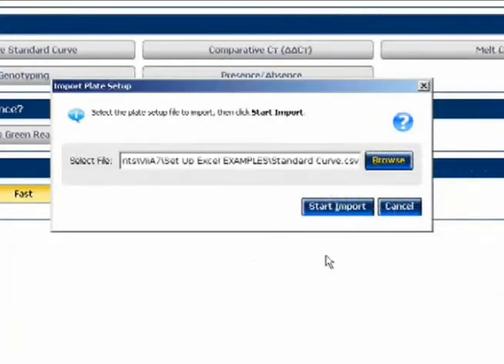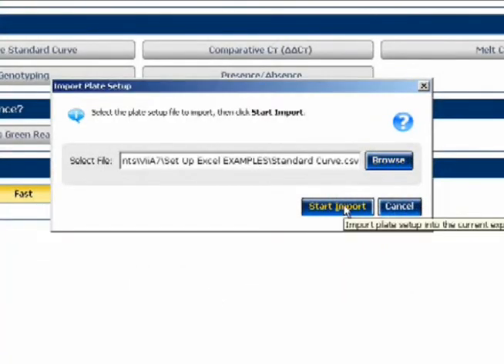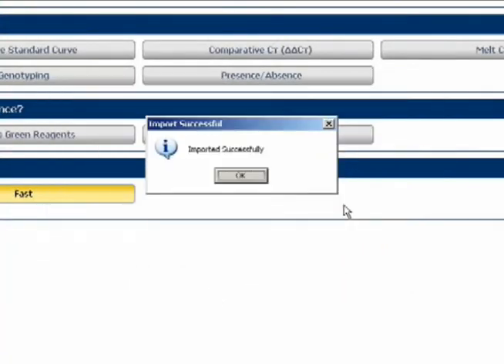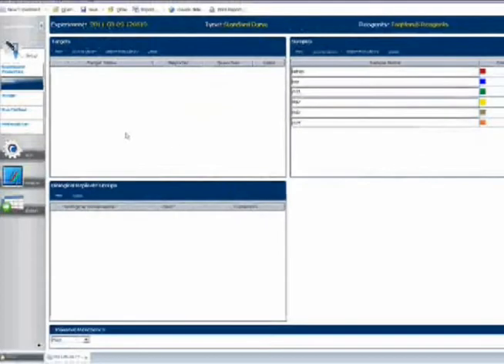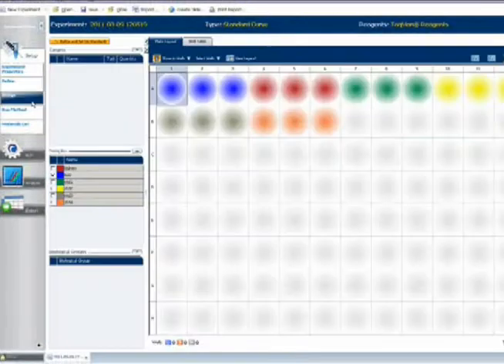Finally, I start Import. And that's all there is to it. The information has now populated my new run template.